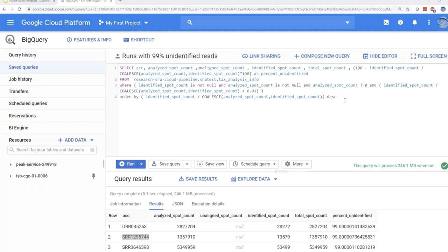Okay, thank you, Yuri. Another question had to do with the contigs, and I think you mentioned that they should be available before too long. How soon do you think they will be available? So the contigs for metagenomic data sets are available now, and I think I added the link to the documentation into the presentation, but if it's not there, I'll make sure to send out the link to the documentation after the presentation.